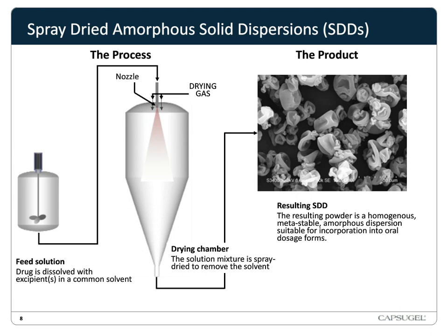And in this process, the drug and the excipients, generally one being an amphiphilic polymer, are dissolved in a common solvent. The solution is then atomized into a stream of hot gas, evaporating the solvent off at a rapid rate, trapping the drug in an amorphous state within the glassy polymer. The resulting powder is comprised of a homogeneous dispersion readily integrated into an oral solid dosage form. And an example of what the particles look like is in the SEM micrograph on the right of the slide. So by manipulating the spray dry process, we can start to engineer these SDD particles.